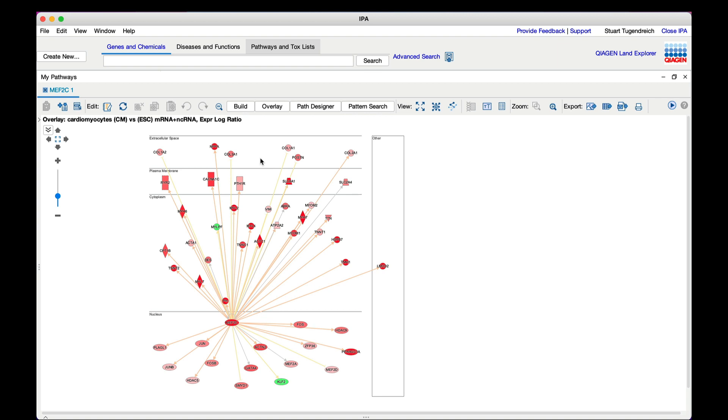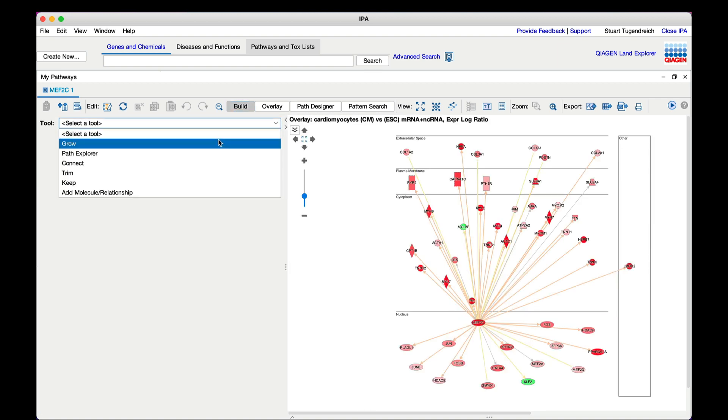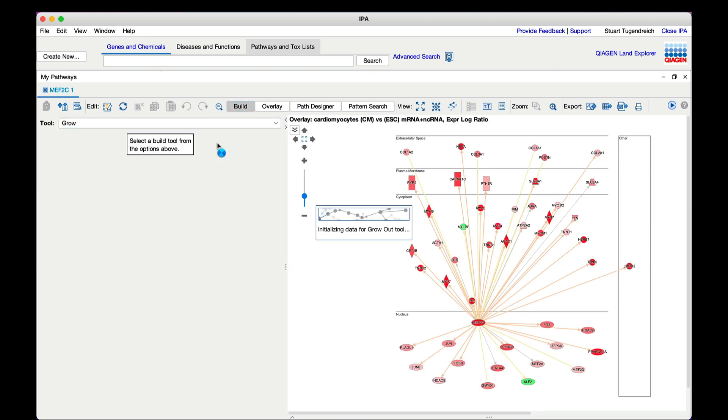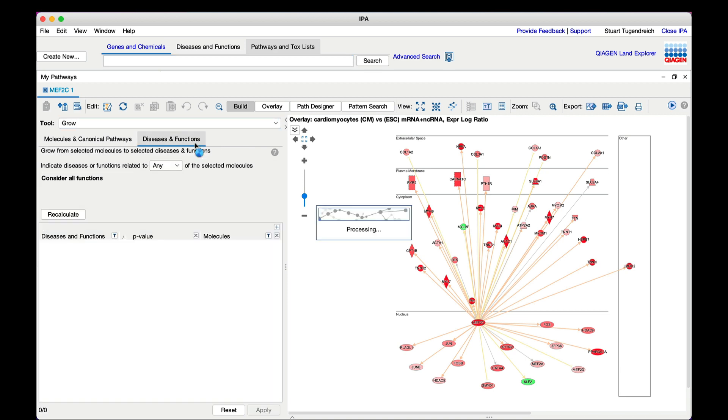Click on the Build button in the toolbar above the network, select Grow from the drop-down menu, and then click on the Diseases and Functions tab in the panel that appears.